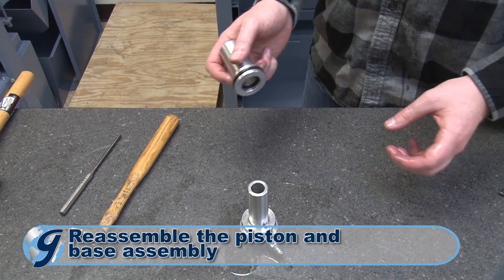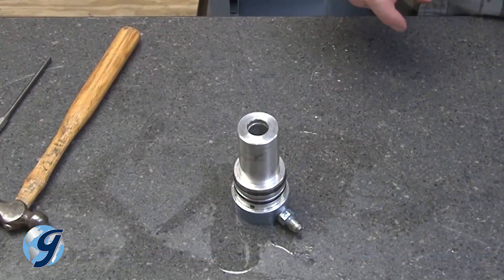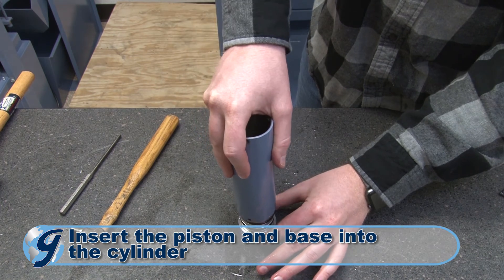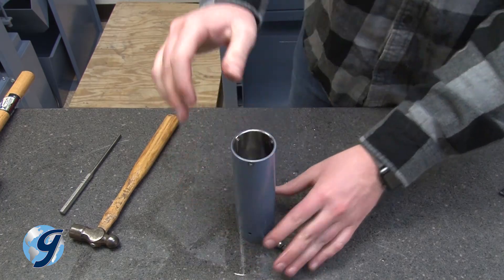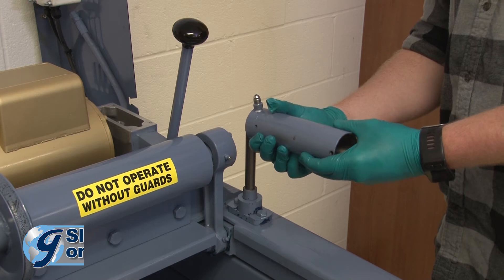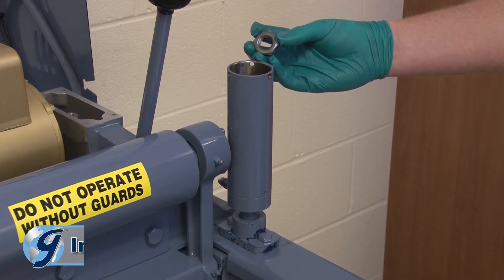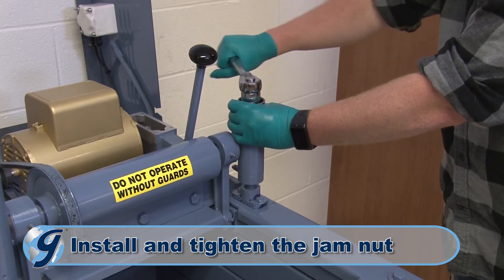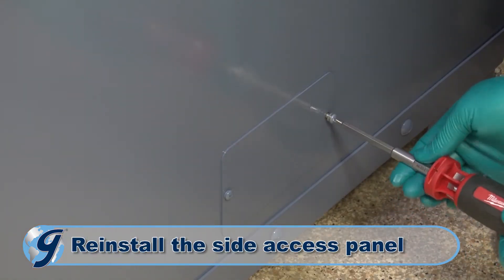Now, reassemble the piston and base assembly. Make sure the piston is lubricated with hydraulic oil during this process, and insert both into the cylinder. Secure with the three roll pins. Slide the reassembled hydraulic cylinder onto the clamp rod. Next, install the jam nut and tighten. Unclamp the lower section of the clamp rod and return the side access panel.